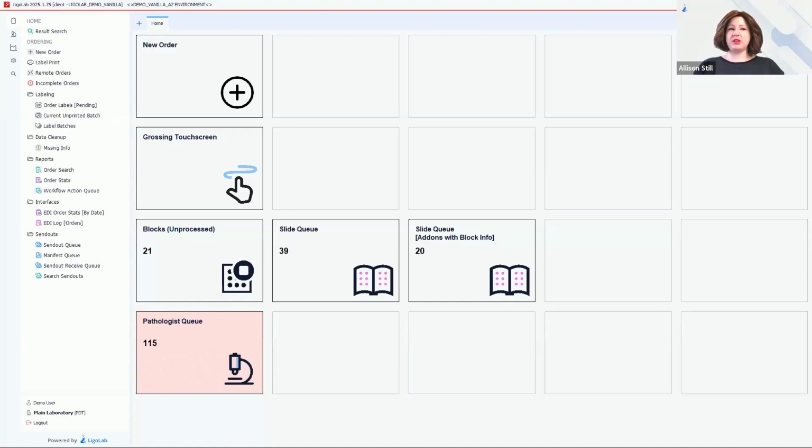We are going to go to the pathologist queue later, but just to say a little bit about assignment, any property of the case can be used to determine which pathologist will be assigned to read that case. Common criteria would be state licensure, specialty, client or physician preference, even a billing preference. But really anything the system knows can go into who it's assigned to. And those will be handled by similar rules to the lab order rules that I showed.